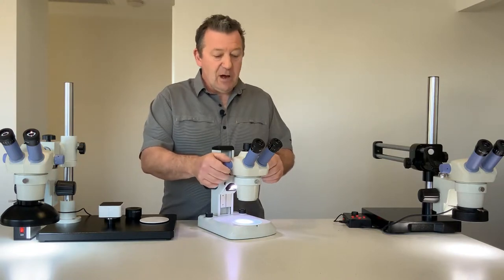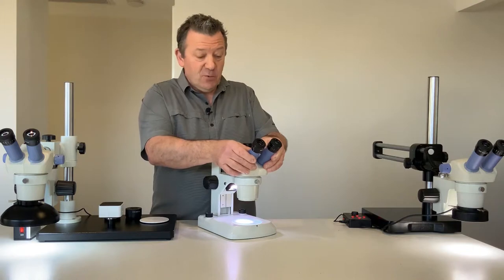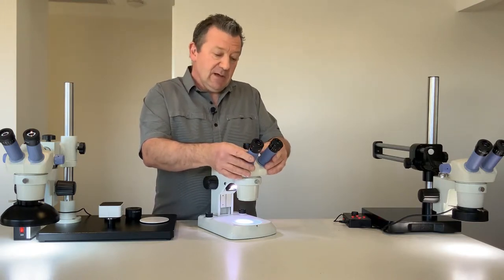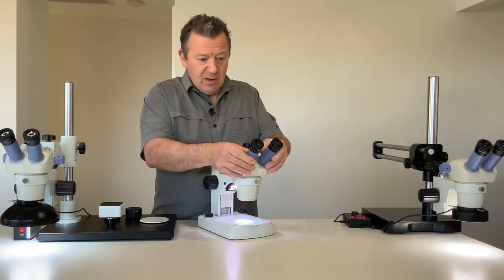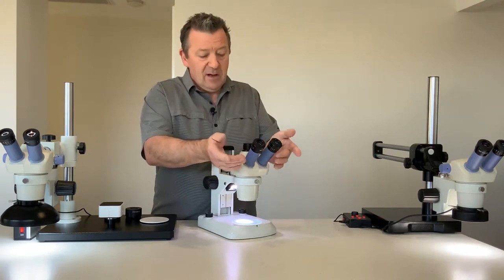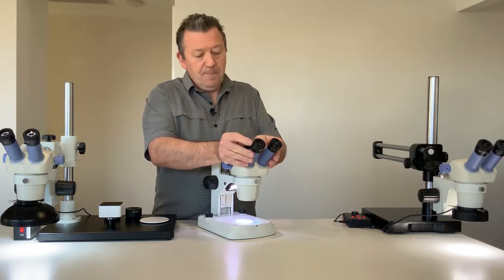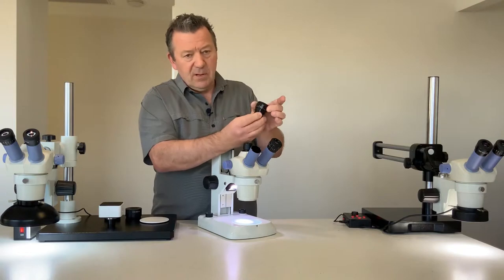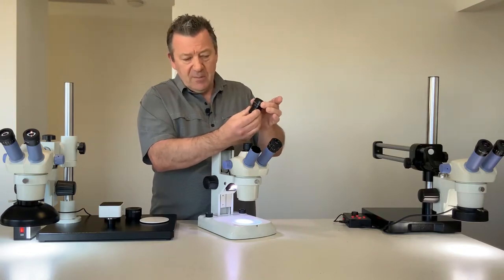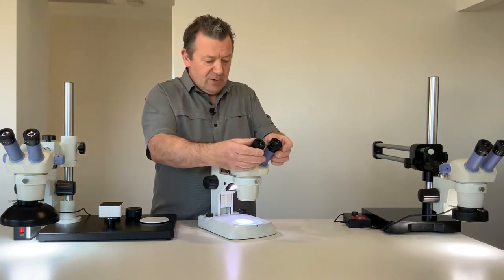On this microscope we have interpupillary adjustments for the eye tubes, because not everyone's eyes are the same distance apart, so we have that adjustment. The standard 10 times eyepieces also have diopter adjustments on each eyepiece so you can get both eyepieces into focus the same.